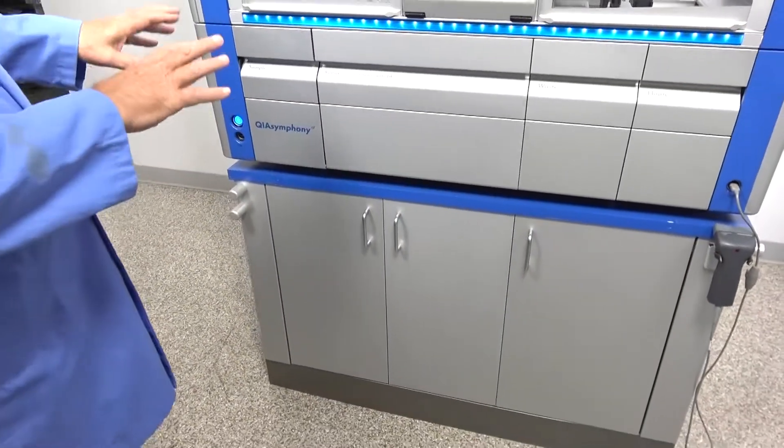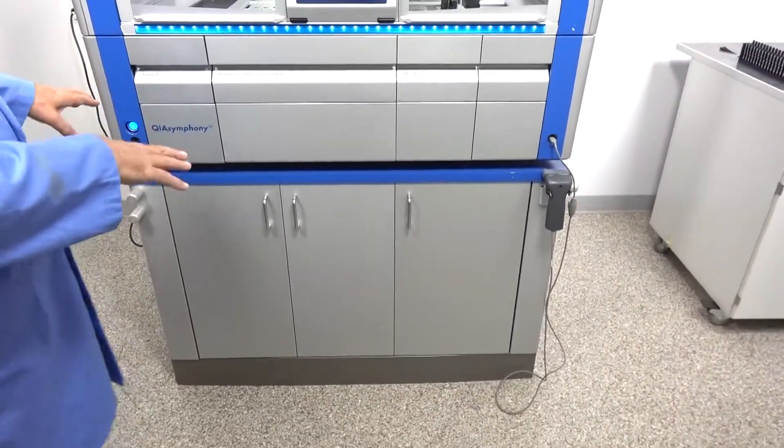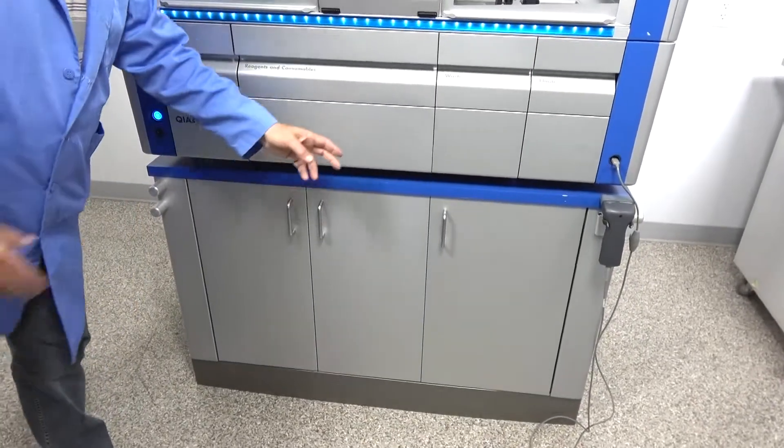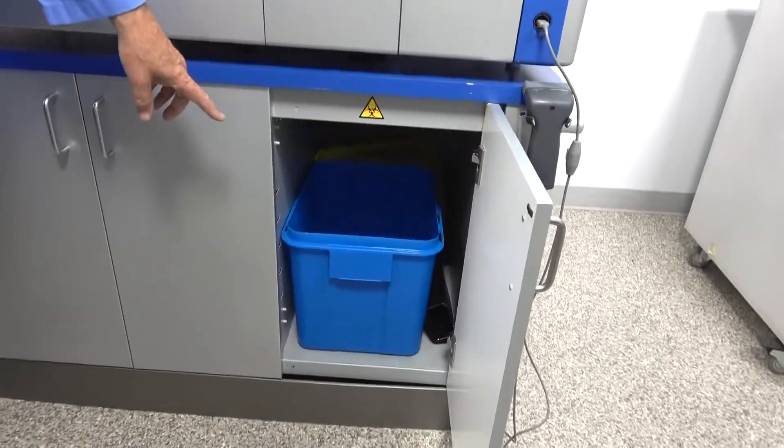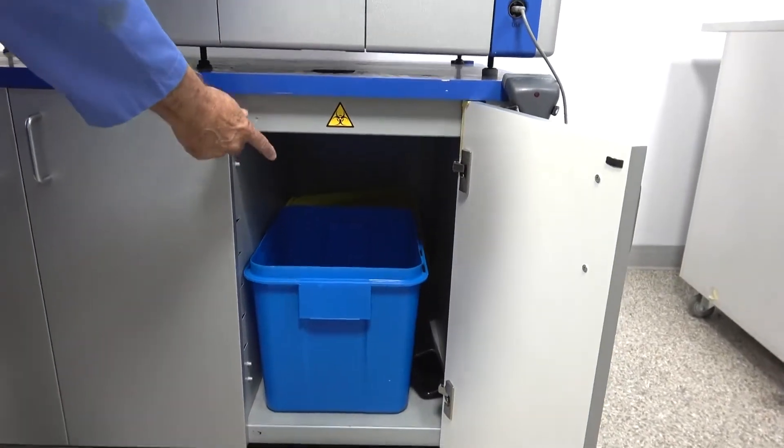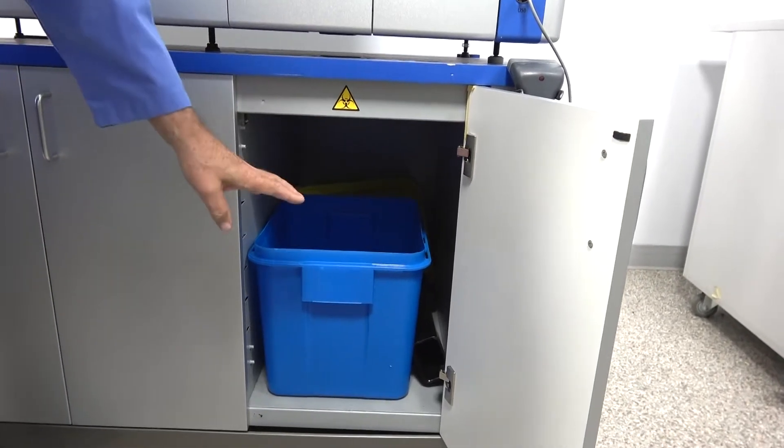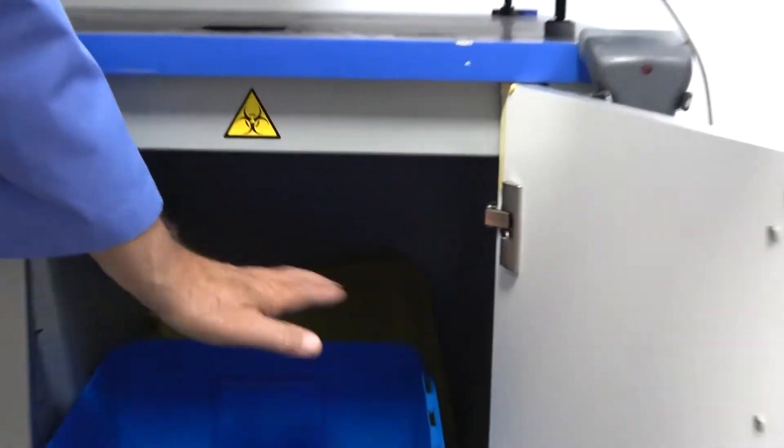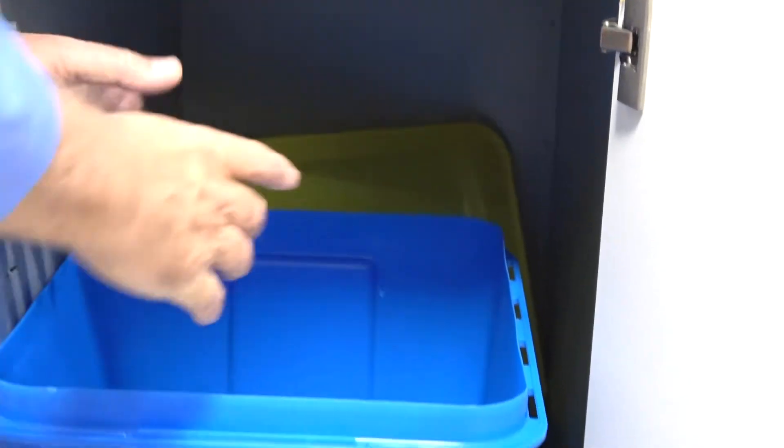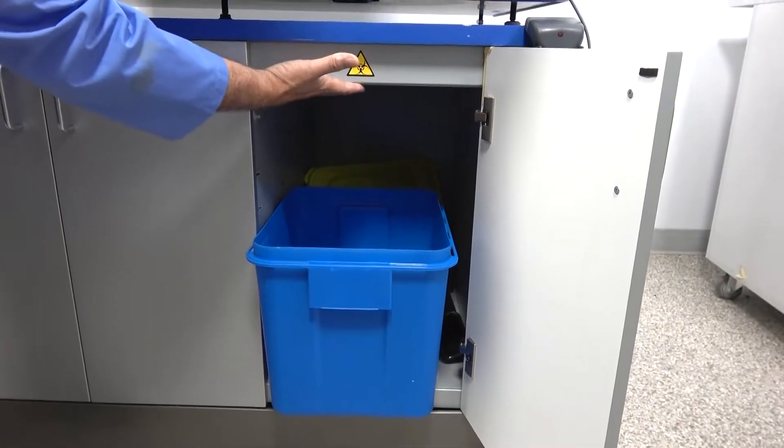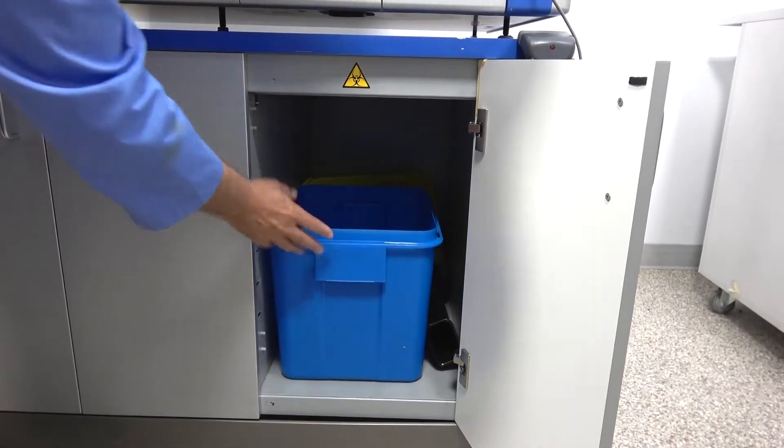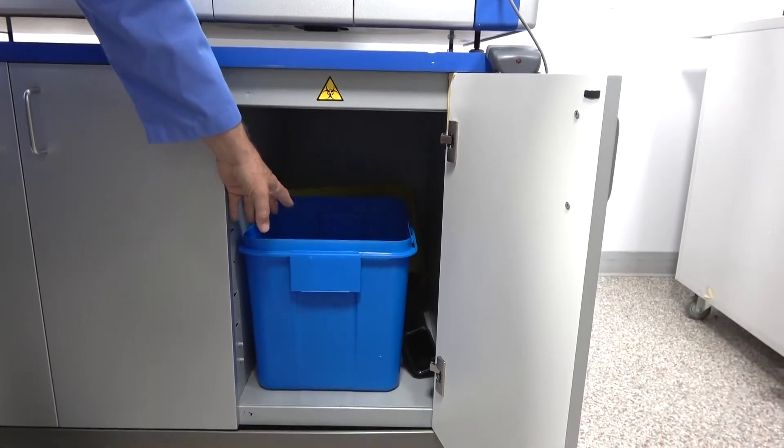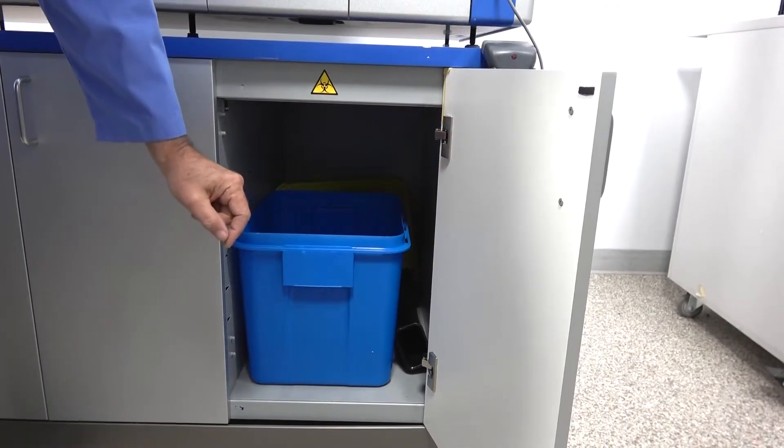This one, we have it shown on the factory installed rack. We do offer these many times. Check your listing. It's a real handy rack. It does have a built-in place for your waste bin. And there is a chute that will come down and close in. One of the things that you want to know is whether this has the lid and funnel for this. In the back there, it's got a solid lid, but it normally comes with a second lid and a funnel that connects this to the bottom of this unit. This particular rack doesn't have one. It's not a big thing. In most cases, you can easily fabricate one or you can buy one from Qiagen.